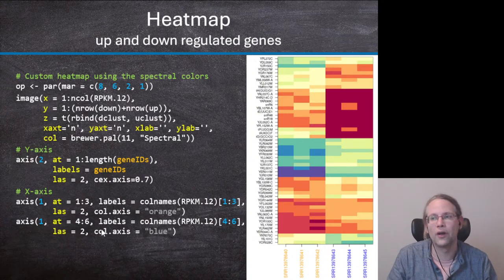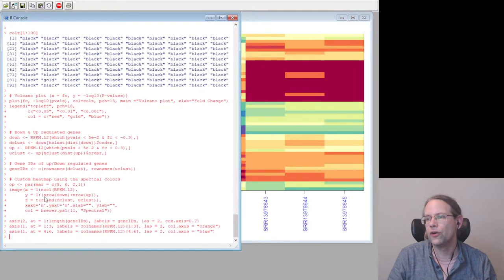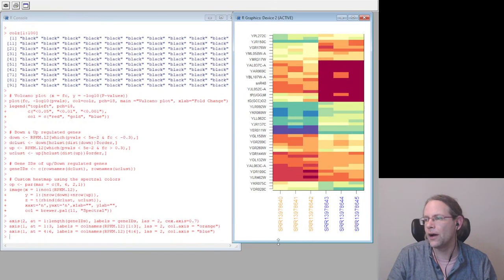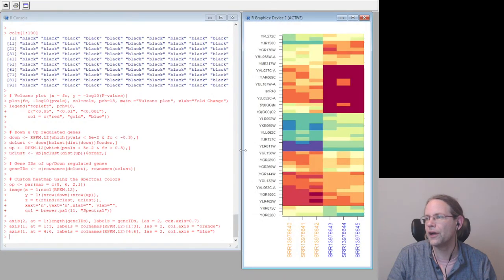So that's just a limitation of how the R axis works. All right, so how does this look? Let me show you in R. Let's switch to R. Let's not forget this time. So we're going to do the plot like this, right? And now when we squeeze it a little bit, we can see that the plot starts looking really nice.